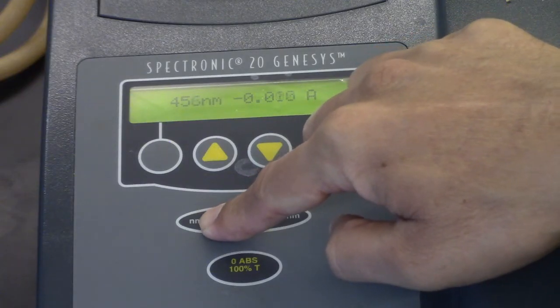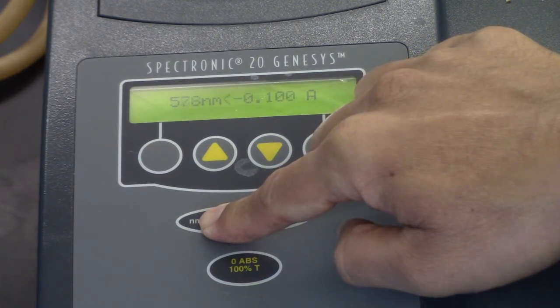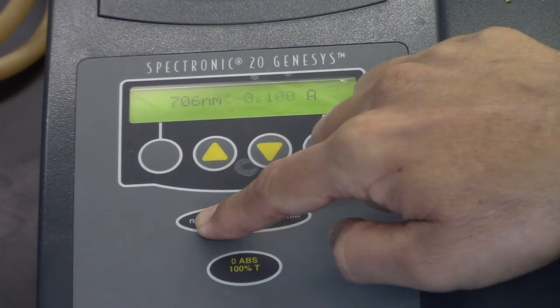Once you identify the wavelength with the maximum absorbance, set the spectrometer to that wavelength for all remaining absorbance readings.